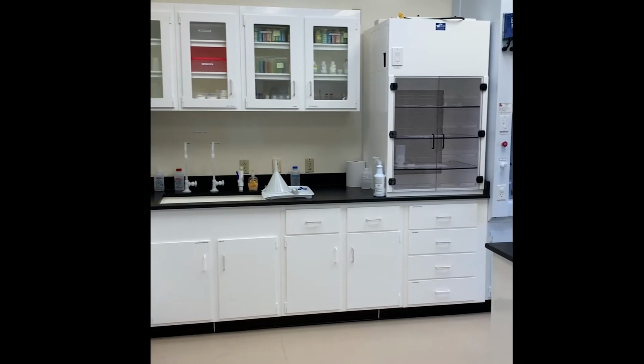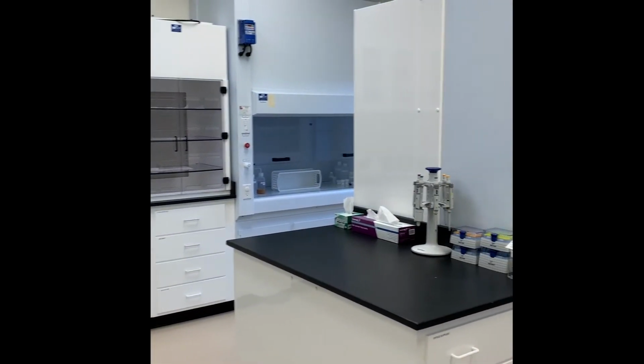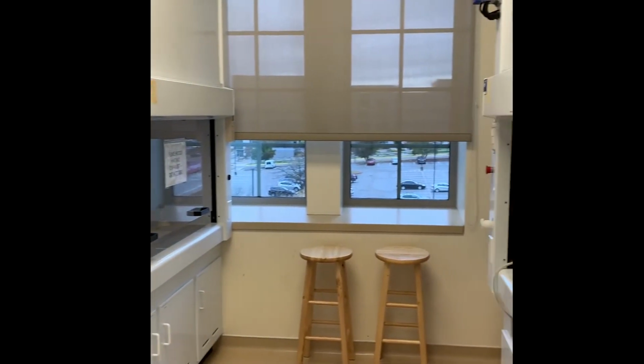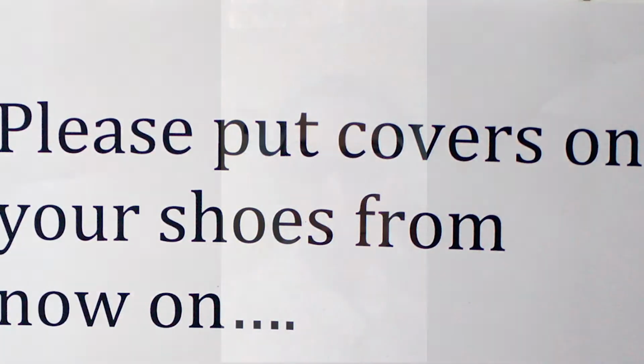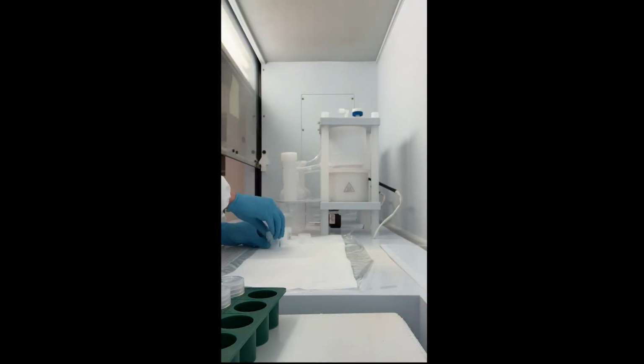So everything inside is wooden or plastic or some other type of material, but no metal anywhere. Now the other thing we need to worry about is metal contamination from things that we may bring in ourselves. This can be anything from dust on the bottom of our shoes to particles on our clothes and even our hair. So this is why I get to wear this pretty sweet setup with the hairnet and these beautiful, beautiful clean suits. Once I'm ready to go into the clean lab, the samples come with me.